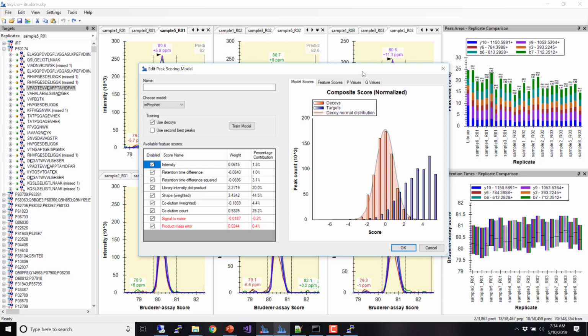It's the same as we saw yesterday, this shape. Oh, actually, we saw it in the command line. That's where we saw it. So this is the same model that we saw printed out in the command line. We get to see all the graphics and everything. But this is the same model that we saw yesterday.